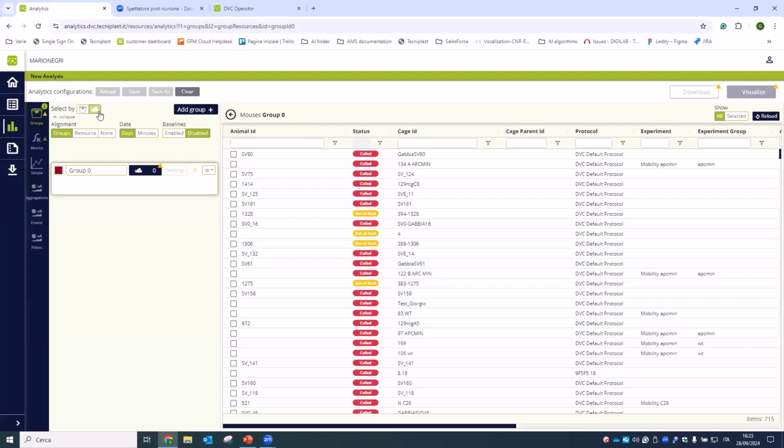So you can still search by animal ID, but please consider that if there are multiple animals in the same cage, and you select 2 animals in the same cage, obviously the data we are referring to are exactly the same. The data referring to animals are the data referring to the cage. So if it is useful for you to find cages, please use the animal ID.